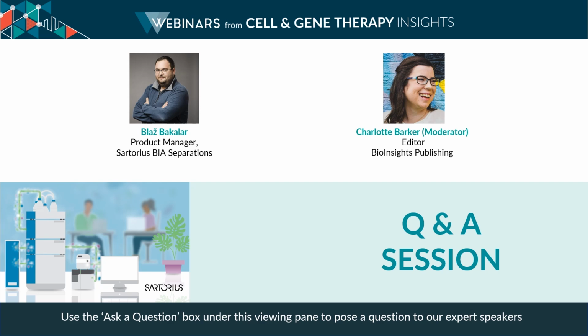Can you speak more to the role of UF-DF, the 3 stages in your process diagram? Are they intended to remove something specific that might cause problems in the next steps, or are they just for general sample cleanup? So we use UF-DF for a few purposes. First of all, it can be used to change the buffer. This is important if you're doing chromatography and you want to be in binding conditions for your sample. Secondly, it's to remove impurities, of course. Like if you're purifying mRNA, which is very large, it's very easy this way to remove residual nucleotides and capping reagent, for instance.